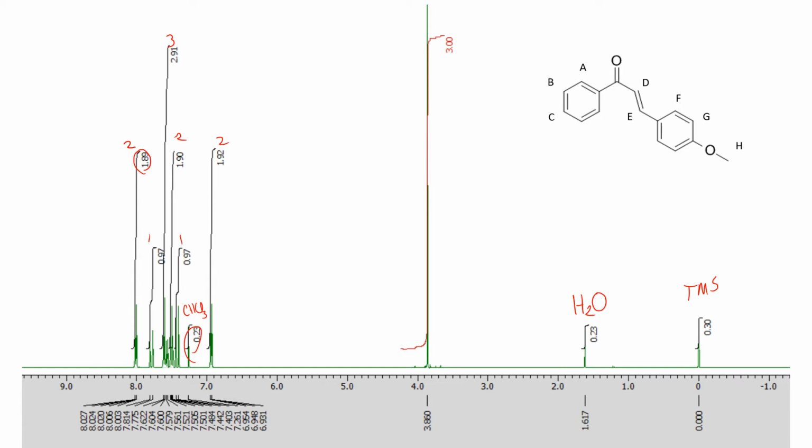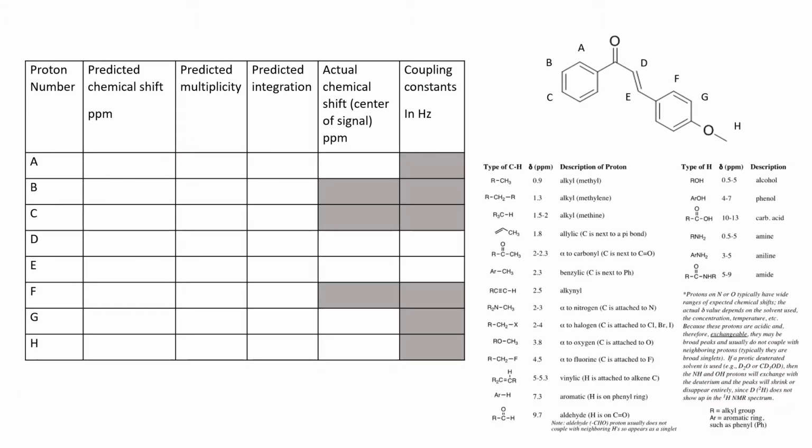Is our compound. All right, so the first thing you need to do is get that table that's in your assignment and fill in the predicted chemical shifts, and you'd use the table here. This is posted either here in this slide or in the last lab where we had it. I think Friedel-Crafts, this is posted, or Diels-Alder somewhere. You can get access to this.